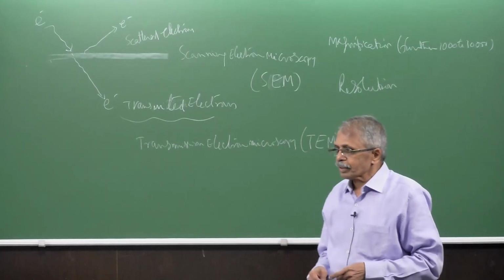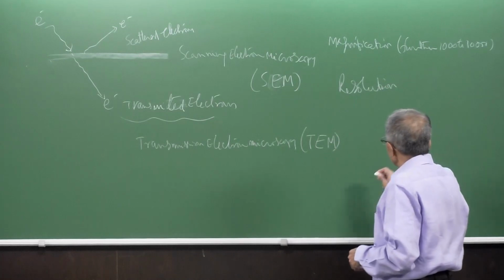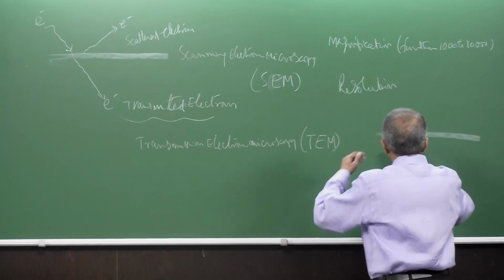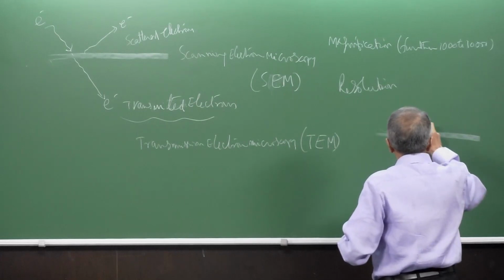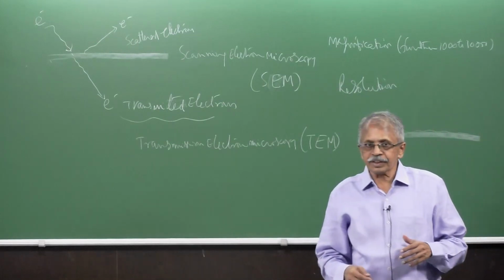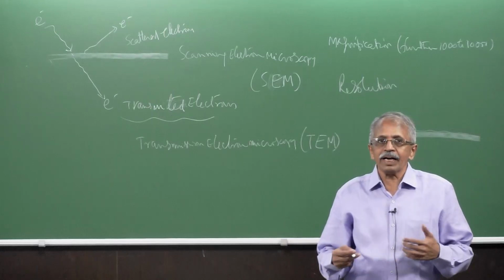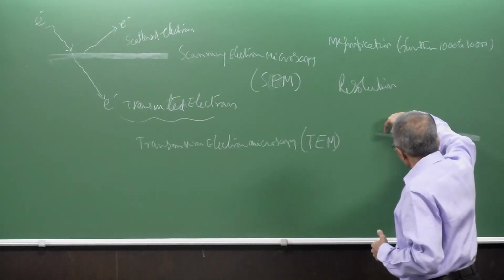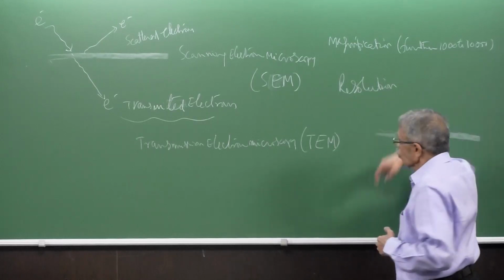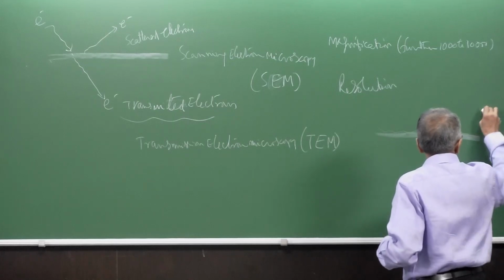There is another microscopy which is also used. Suppose you have a surface, so you just touch the surface and try to see what is there. Instead of passing through or reflected electrons, you will have some sensing element which keeps touching or staying close to touching, and moves across the x-axis, y-axis and z-axis.